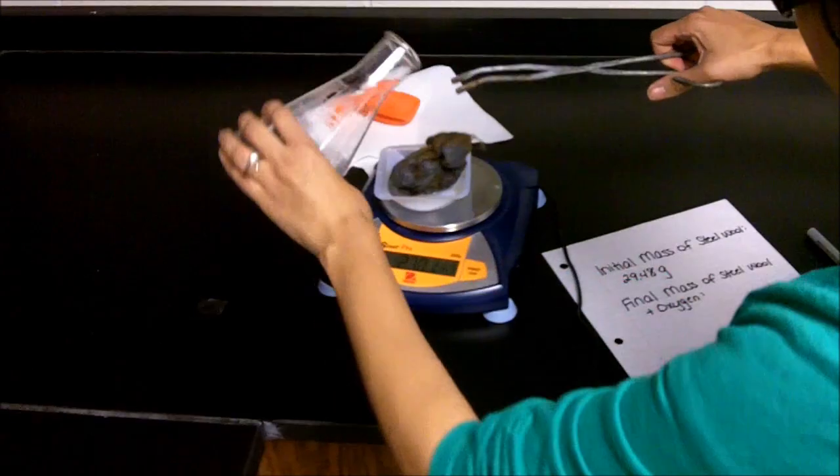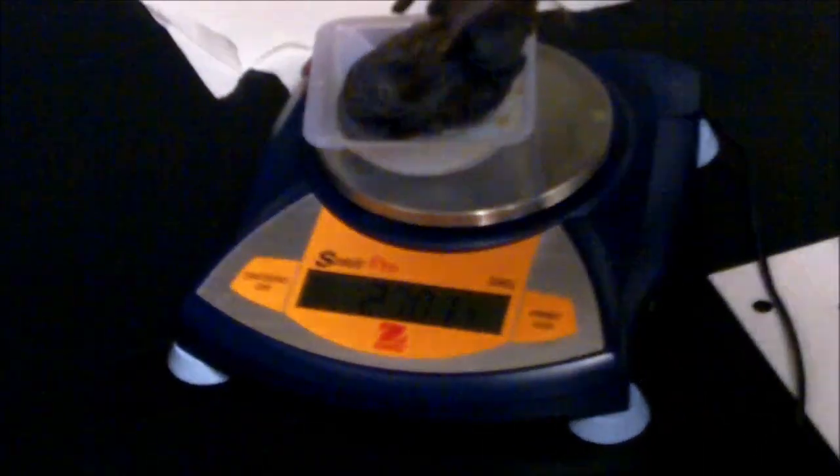We can see what the mass is afterwards. We also want to look at the steel wool. If you notice, we actually see what looks like rust — it's actually iron oxide that has formed on the steel wool itself. Before it was shiny, and now we see that it's reacting with the oxygen, so we can see the iron oxide forming.